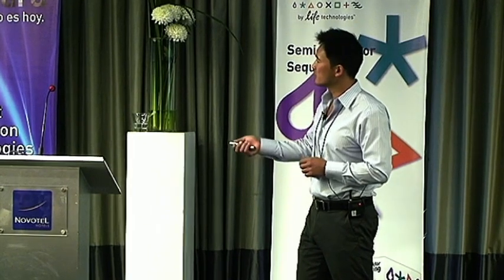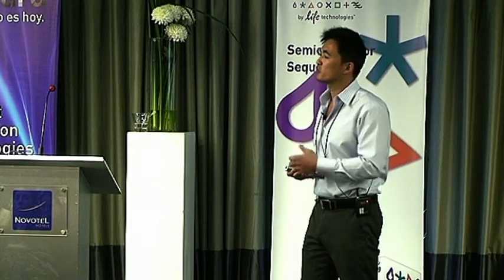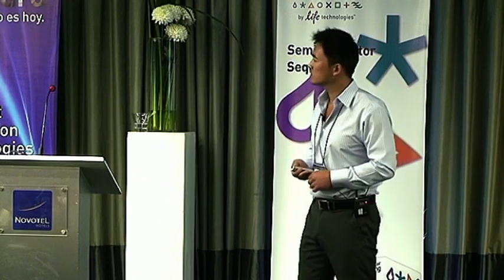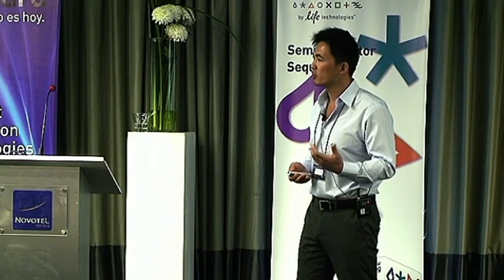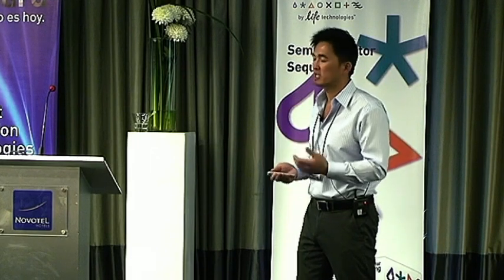And what they did is they did PCA analysis, principal component analysis, to simply compare the results. What does it look like with microarray analysis, which is a lot more cumbersome and tedious? Can we achieve the same answer using a very quick and fast qPCR methodology on the OpenArray? And yes, they were. They basically achieved pretty much the same answer there.